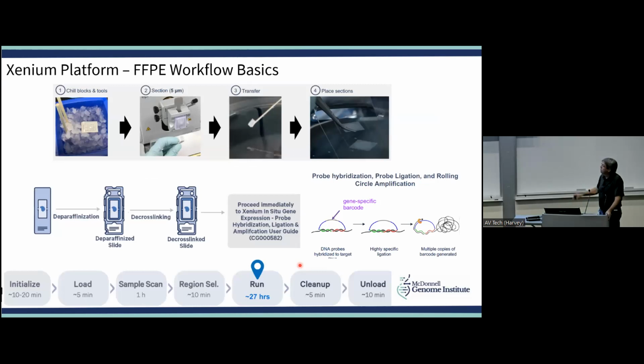Okay, so this is a visual, and I'm going to get more into the actual details in just a minute. This is just to give you a sense of what goes on in setting up your experiment and how you have to prepare your materials. So up above, you can see there's a standard sectioning involved. And I'm going to talk about this number 4 in good detail next, because this is really, really critical.